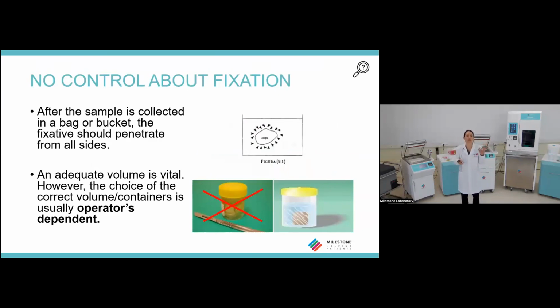The tissue is fresh and it's very important to fix it in a proper way in order to not have degeneration of the tissue. So if for example the container is too small, the formalin will not be enough. As you know, the formalin hardens the tissue. So then in the pathology lab, the extracted tissue may have the shape of the container.